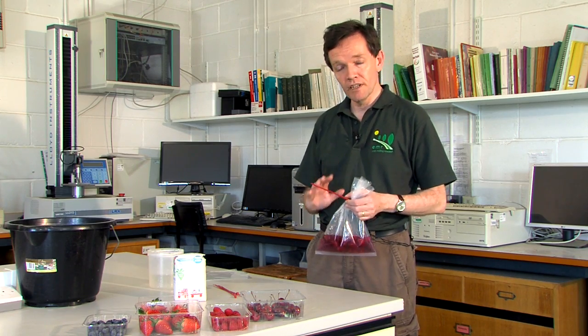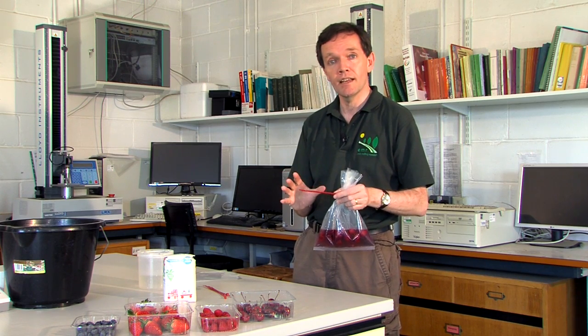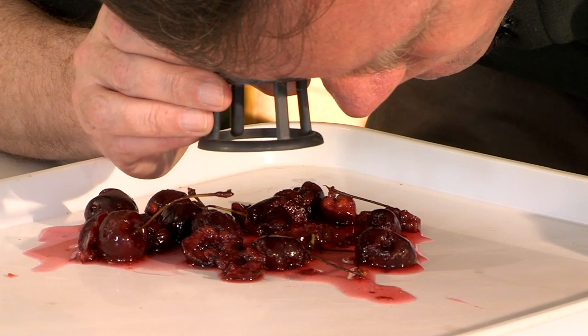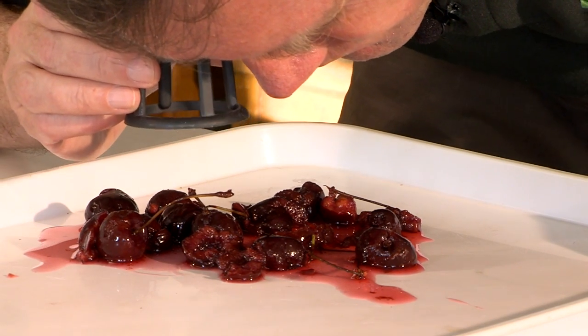Just to reiterate, you can use this method on all of the four fruits that we showed at the start. Works equally well. If you want to be completely reassured that you don't have any SWD in your fruit, you can pour away the solution, put the fruit debris on a tray and just go through it with a hand lens.